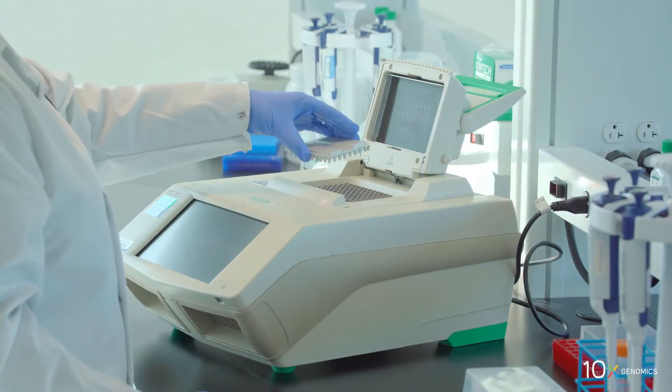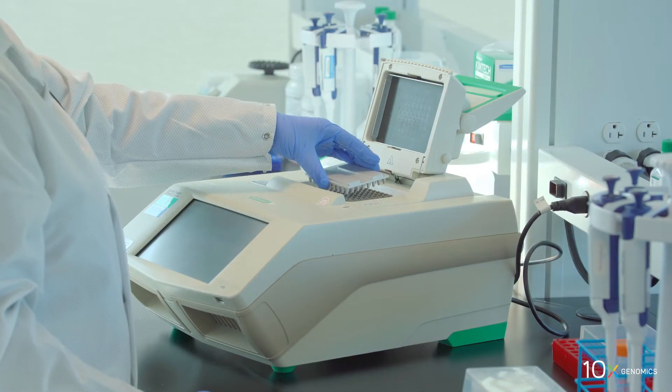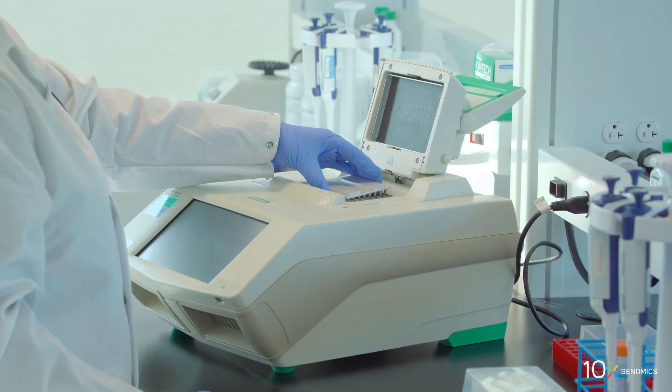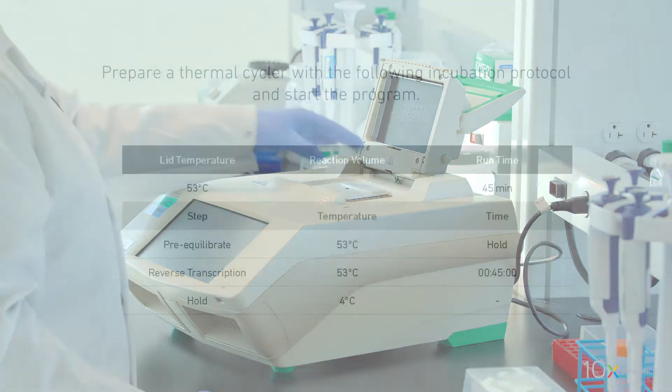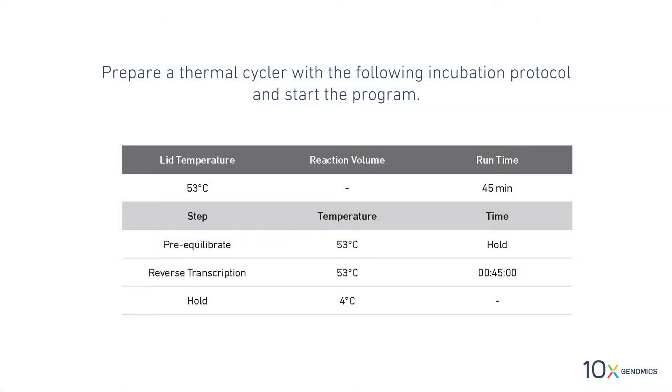We have completed tissue permeabilization. Now we will perform reverse transcription. Place a thermocycler adapter in the thermal cycler, prepare a thermal cycler with the following incubation protocol, and start the program.